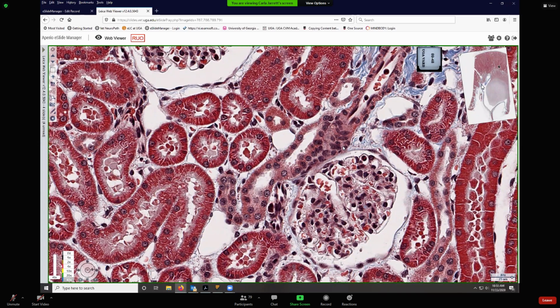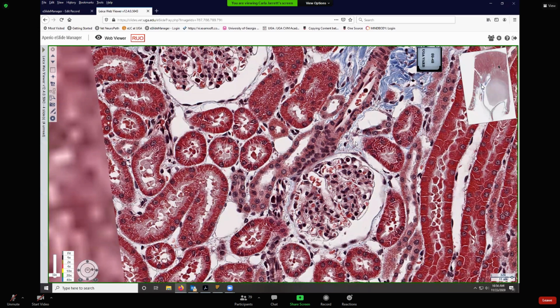So we were just wanting you to be able to identify one of these components, say like put a box around the macula densa cells, or outline the extraglomerular mesangial cells, or indicate the afferent arteriole, which of course would have those JG cells. Okay, let's see what else.